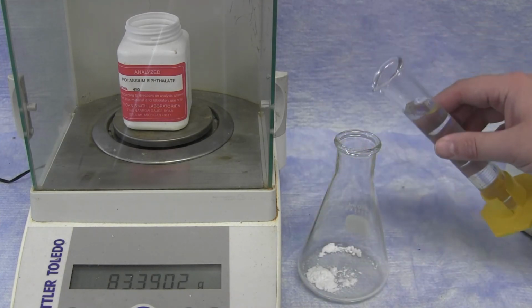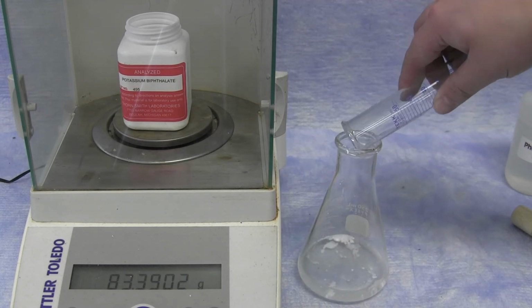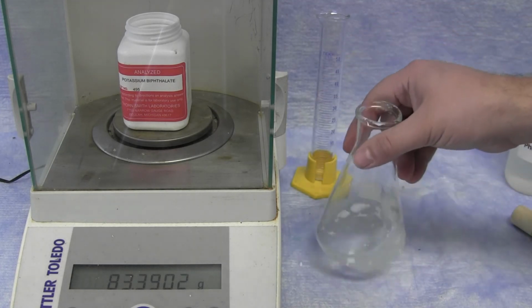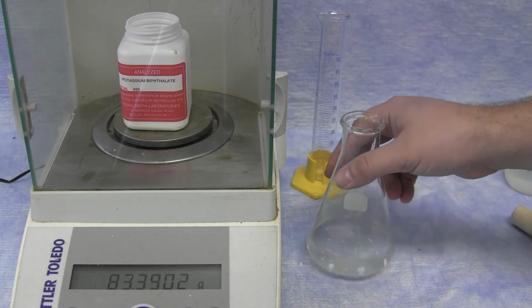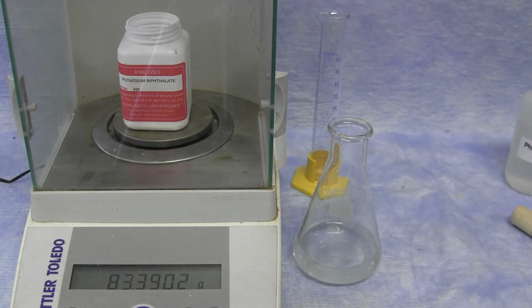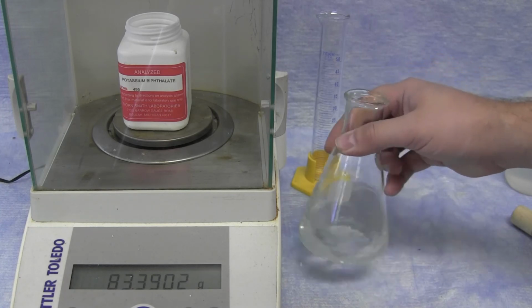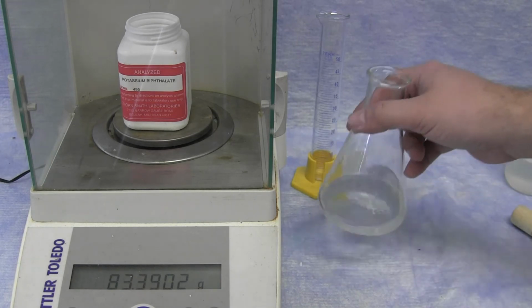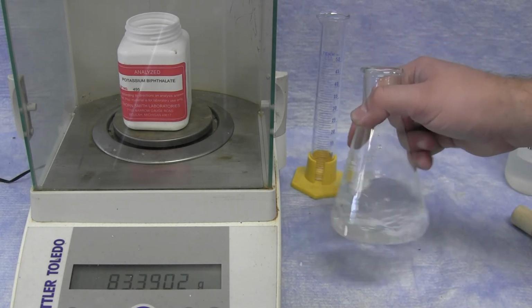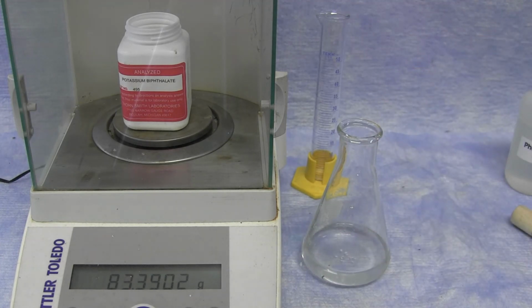You can then dissolve this powder in 50 to 100 milliliters of water. If it is beginning to be a little bit too difficult to dissolve, you can place it on a small hot plate, and that should increase the solubility. But once the sample is dissolved in the water, it's ready to begin the titration.